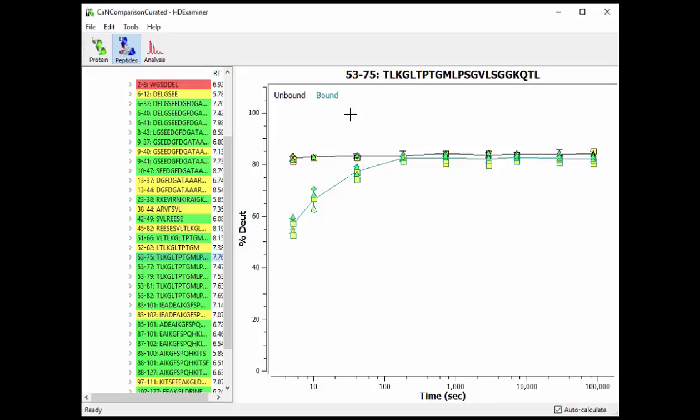Well, what's an EMF file? An EMF file is a Windows internal vector graphics format. Why is that important? Well, because vector graphics, if you use the right tools, are infinitely scalable. And that's what I'm going to show you today.